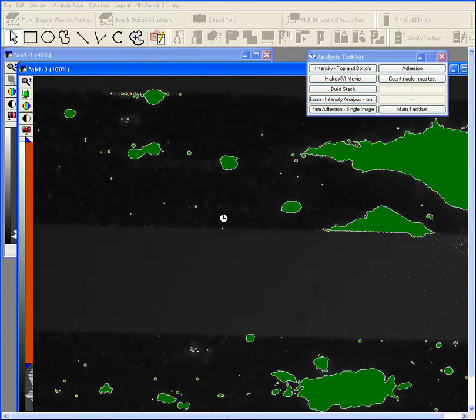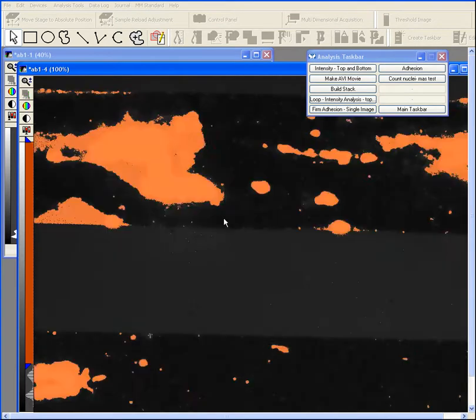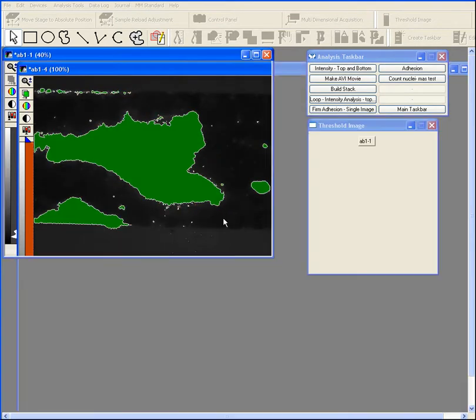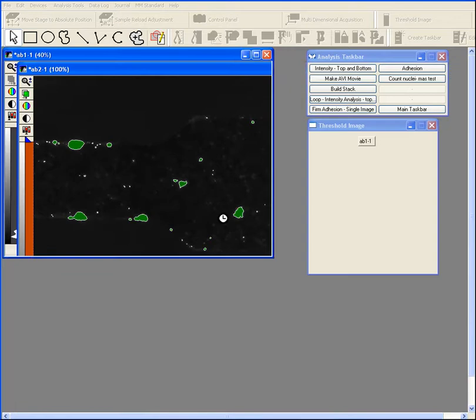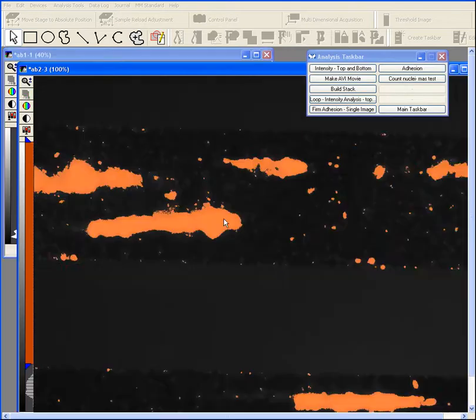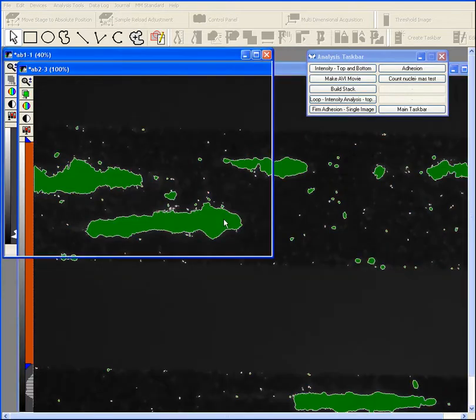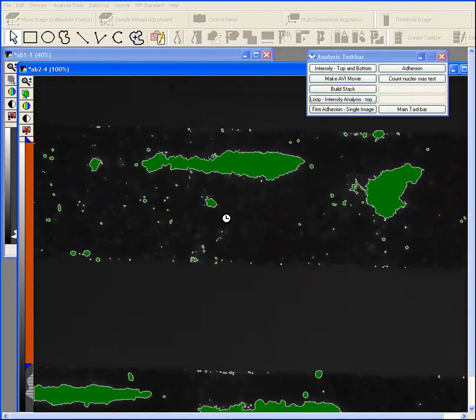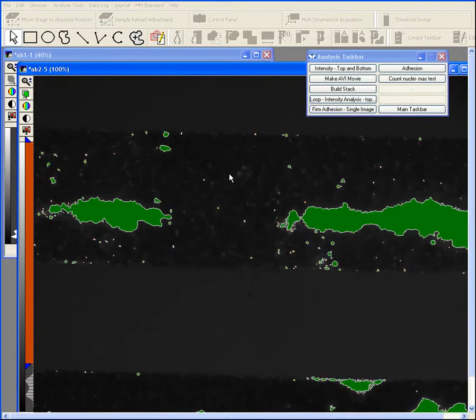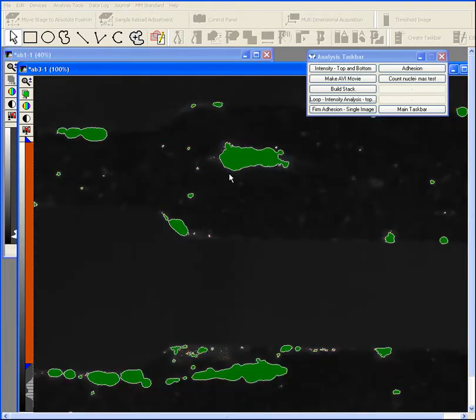So what it's doing right now is cycling through the entire set of images in that directory and it's calculating all the morphological data for the platelet adhesion objects.